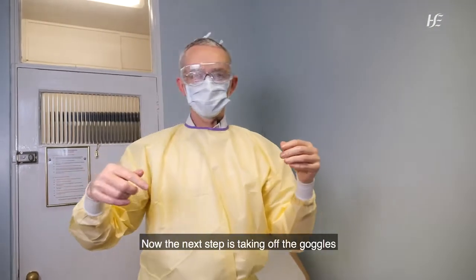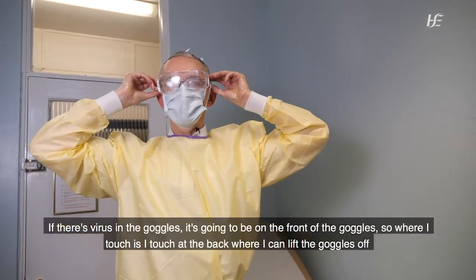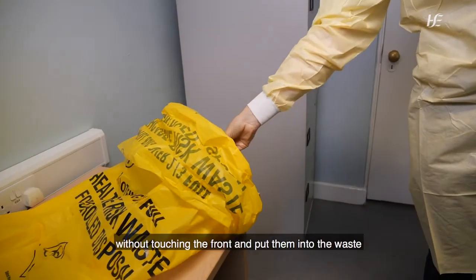And now the next step is taking off the goggles. So if there's virus in the goggles, it's going to be on the front of the goggles. So where I touch is I touch at the back, where I can lift the goggles off without touching the front and put them into the waste.